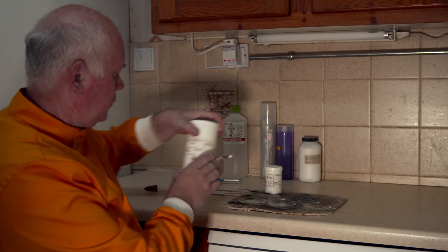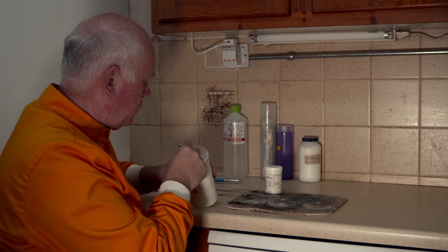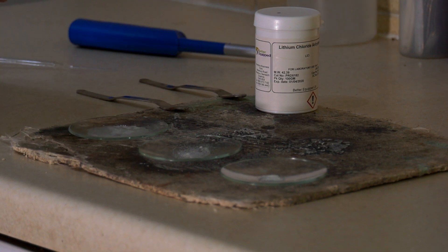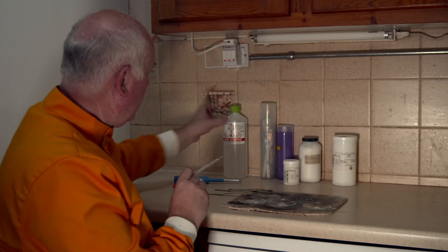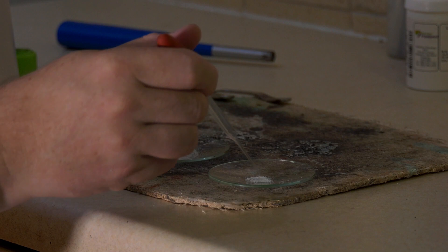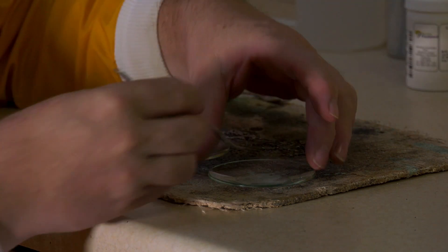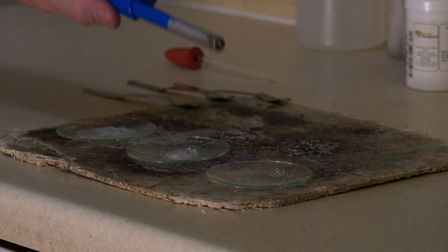But the most fun one to do of course is to try and have a look at Dragon's Breath. This is disodium tetraborate, and I'm going to take a small amount of this, and again we're going to add some methanol. Then let's see — here's Dragon's Breath.